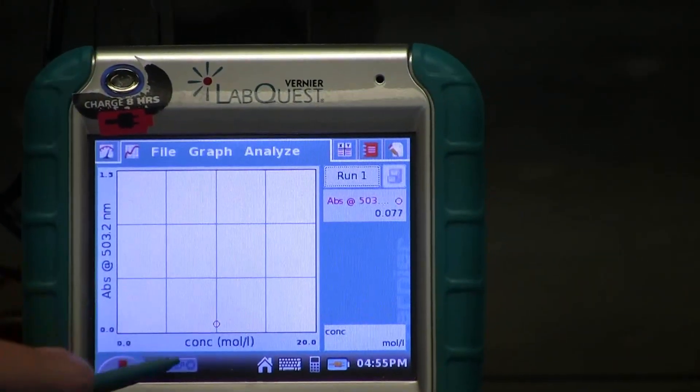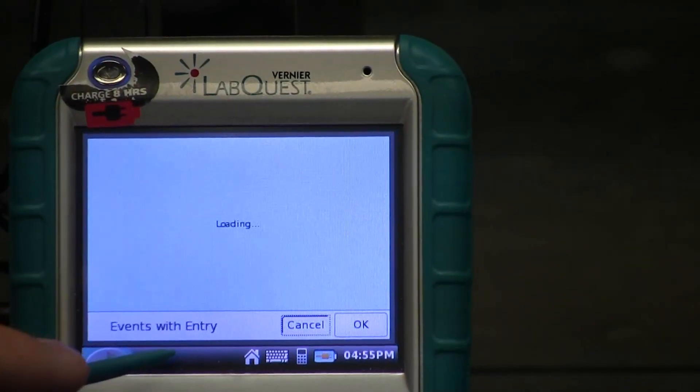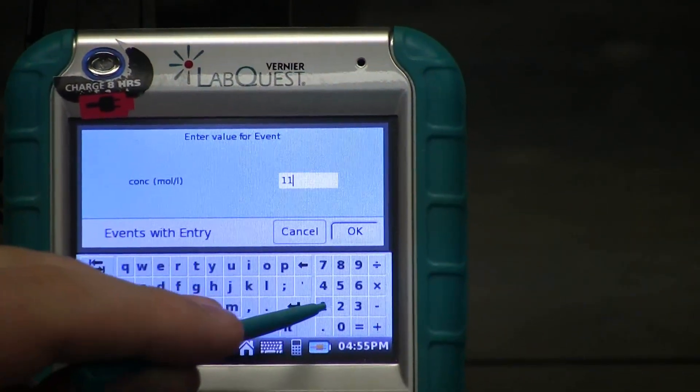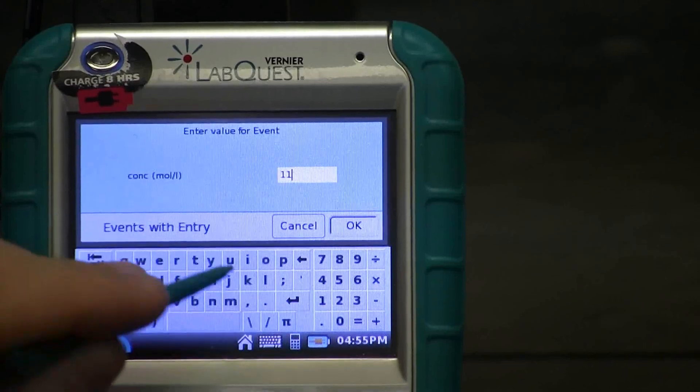You will then click Keep. You will need to enter the concentration of each cuvette, one by one.